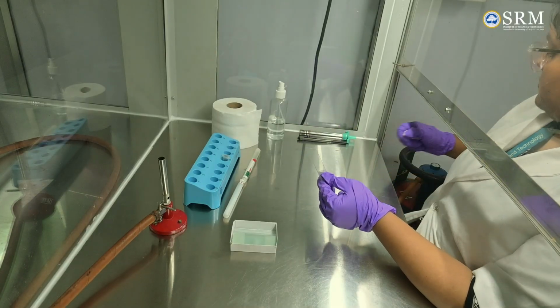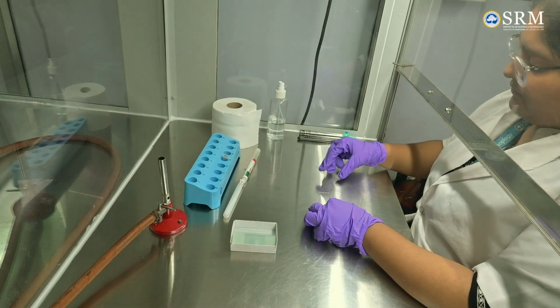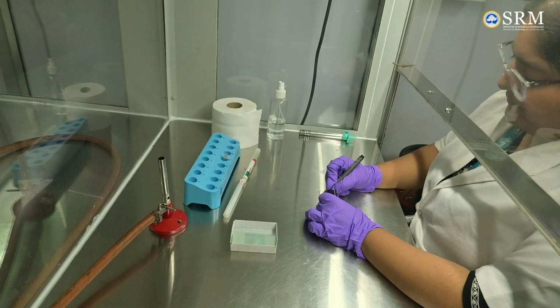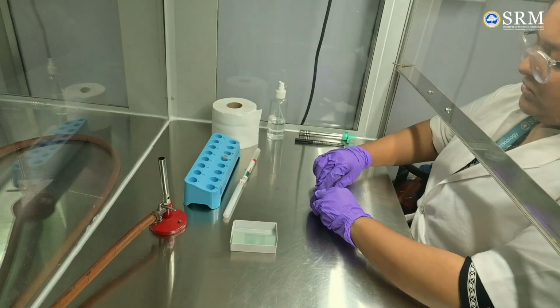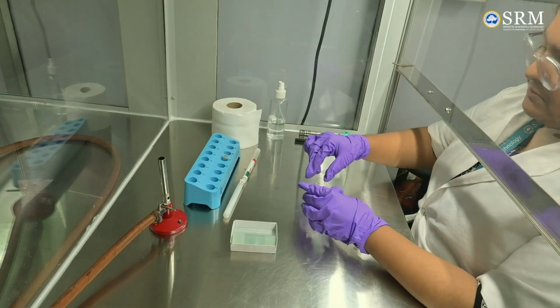Then we mark a circle on the slide. Turn it to the opposite side, and it is here where we'll make the smear.